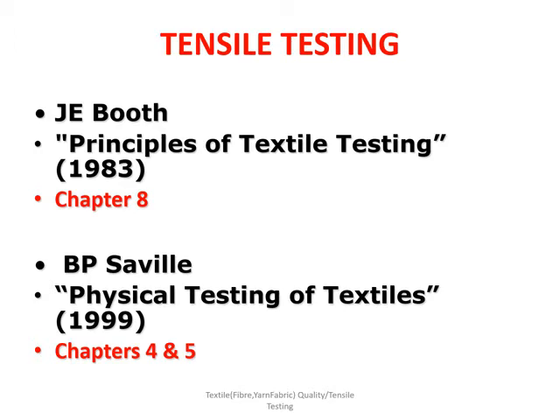Tensile testing is a very important topic. The principles behind any tensile testing instrument are common, whether it is fiber, yarn, or fabric, or garment, seam, anything you test. The principles behind remain the same. It is not only for textiles. The principles are common even for tensile testing of other materials other than textiles. Let us go into the topic tensile testing.